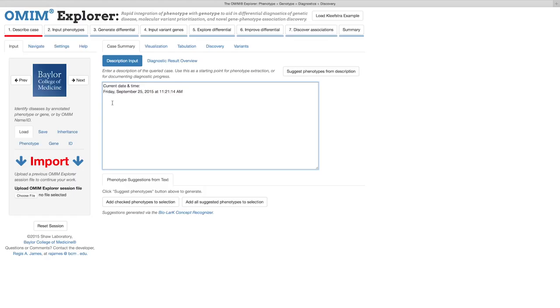I've selected a few paragraphs describing Kleefstra syndrome on the NIH genetic home reference website and will now paste them into the text box.